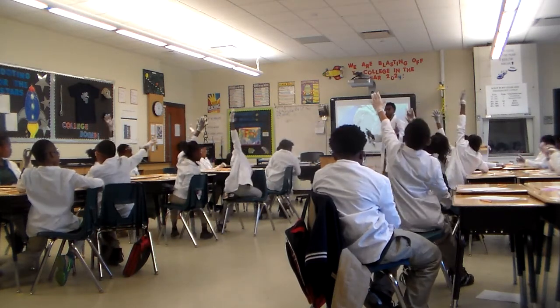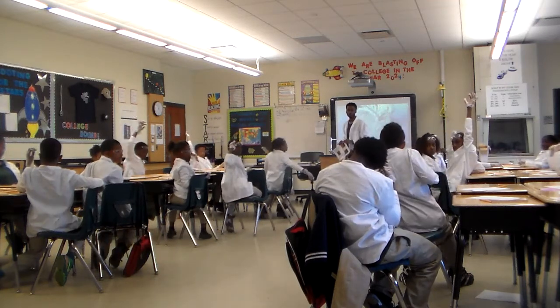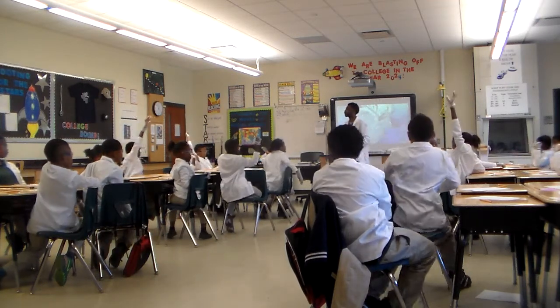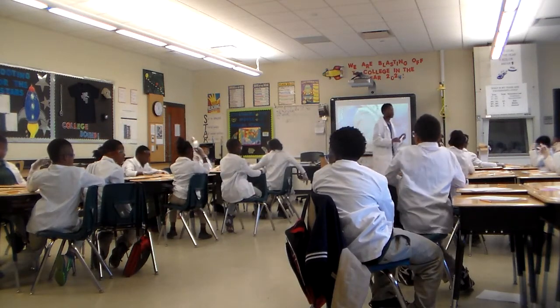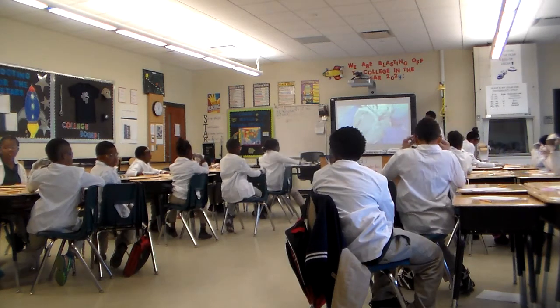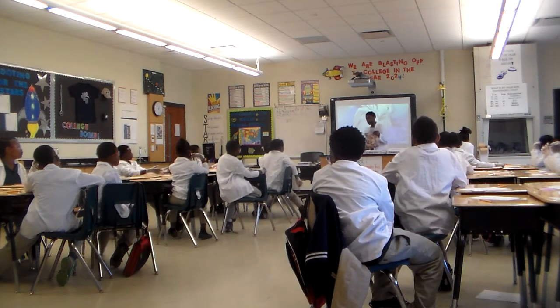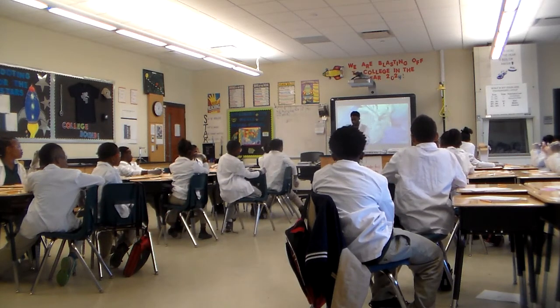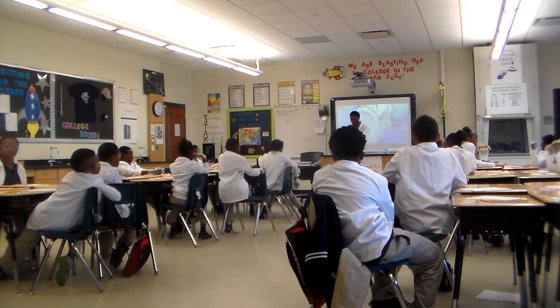And I'll take one more before we head out. One more. Yes? Always wearing safety goggles. Always wear those safety goggles, right? Because they're protecting your what? Hands are down. I know you guys had a lot of cool things to discuss, but I'm ready to get into the fun stuff, right? So, with that being said, I'm going to cut open our bag of specimens with our scientific tools, our what? Scissors. Yeah, our scissors, right?